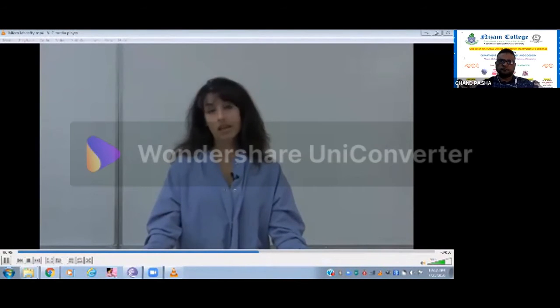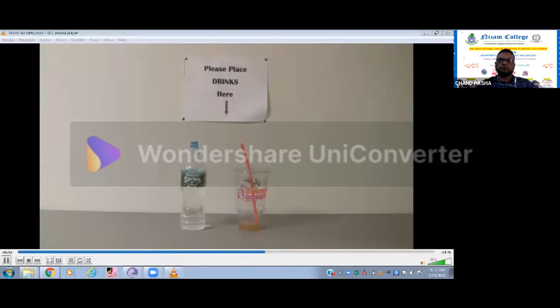There is no smoking, eating, or drinking in the lab. This includes gum and throat lozenges. You must never bring any food into the lab, even if no lab work is being done. You may, at your own risk, leave food and drink on the table outside the lab.